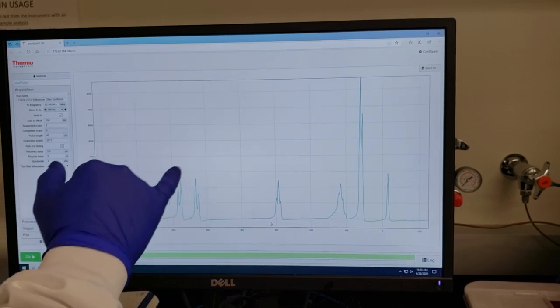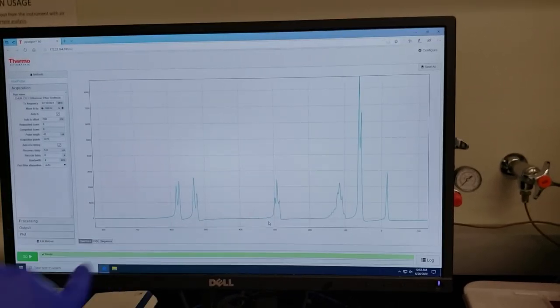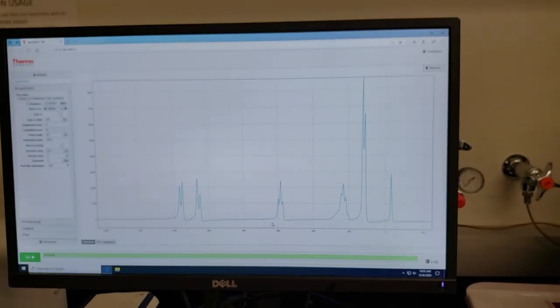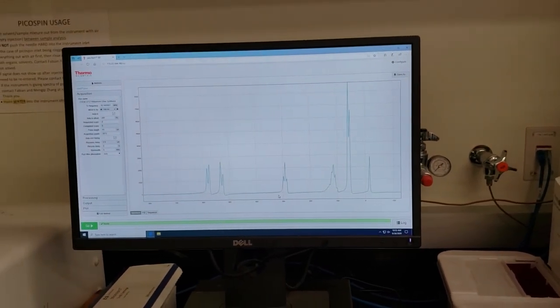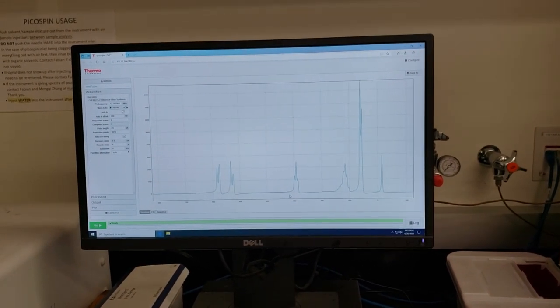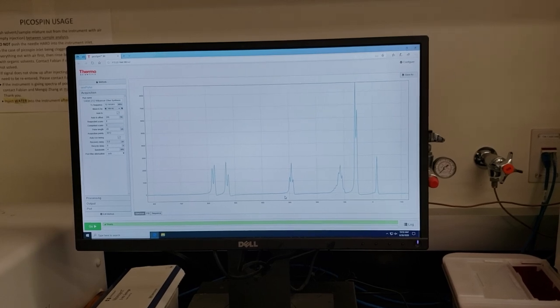I can see already some very distinctive peaks in this region that are very indicative of the product that we're looking for. So we'll post that up to ELC. You'll go through, identify all the important peaks, and then use that in your lab write-up.